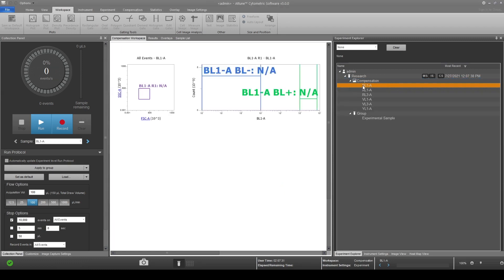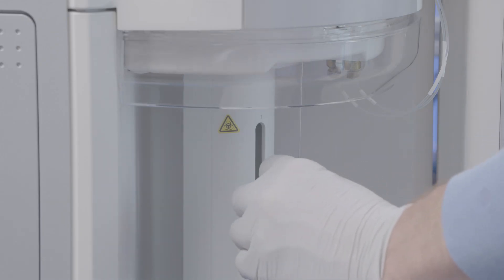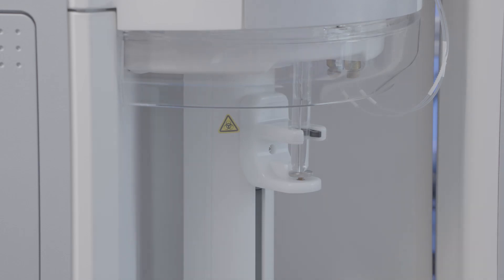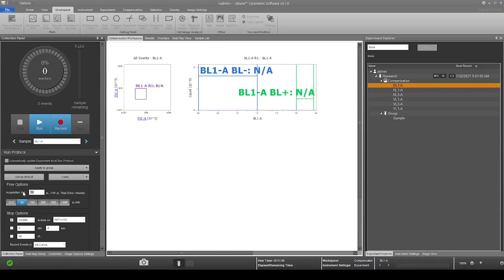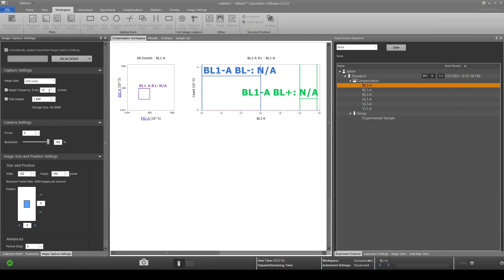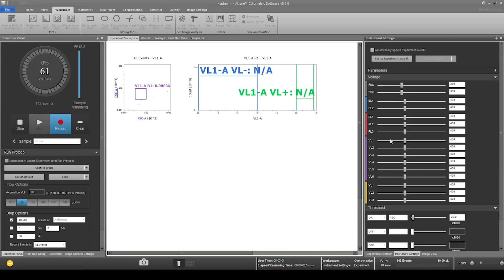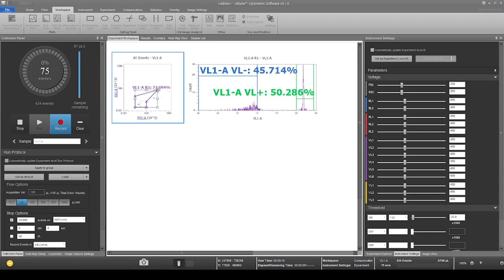Select the first color for compensation adjustment and load prepared compensation beads or cells stained with the fluorophore of choice into the sip. Select a run speed and select the image capture settings tab. To save experimental space during compensation setup, you have the option to turn off image collection. Then from the collection panel, click run. Adjust the voltages for the corresponding color to ensure a positive signal is acquired.